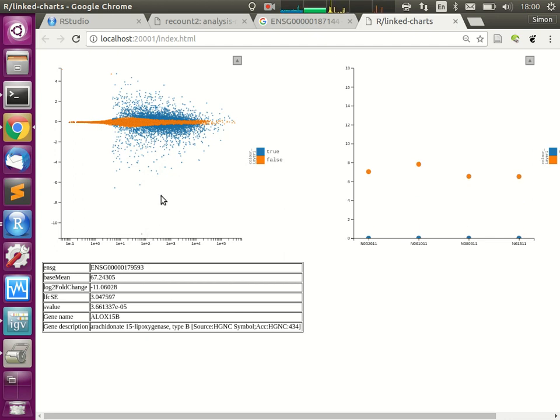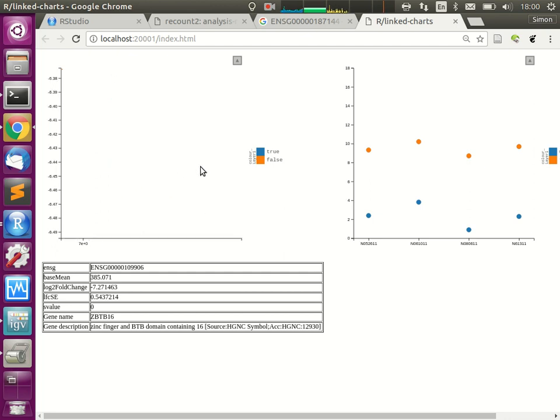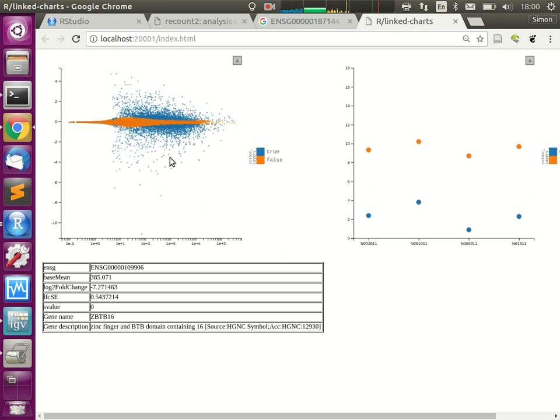Here now we have other things which, even though they are so far small, seem to react strongly. Actually, I now remember when I tested this last time, I noticed I have a sign wrong. So these are the genes which are upregulated under dexamethasone. These are ones which are downregulated. So this is another way of looking at your RNA-seq data, that you just look at those couple of 10, 20 genes which react really strongly instead of pushing them all together.